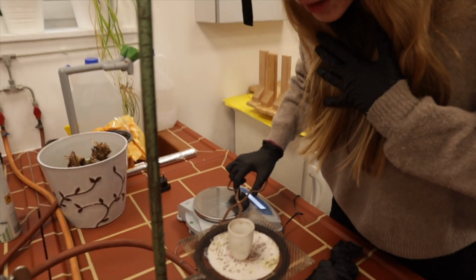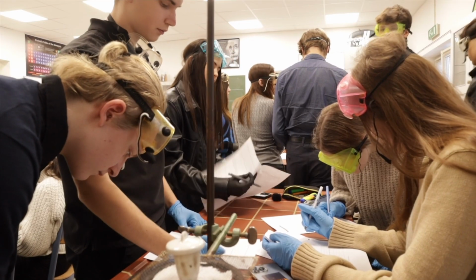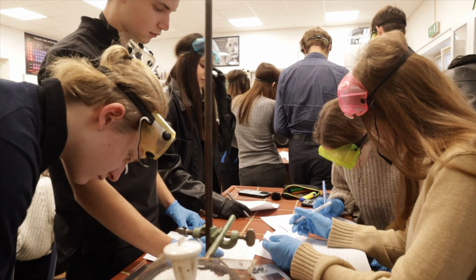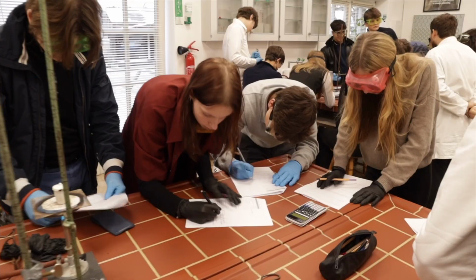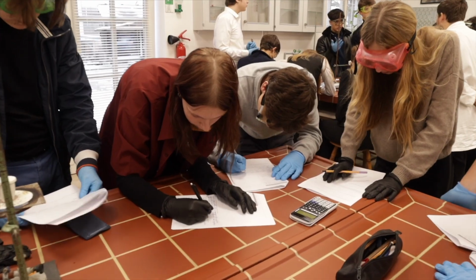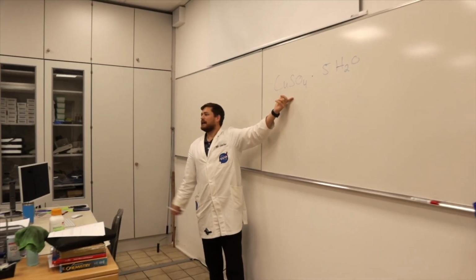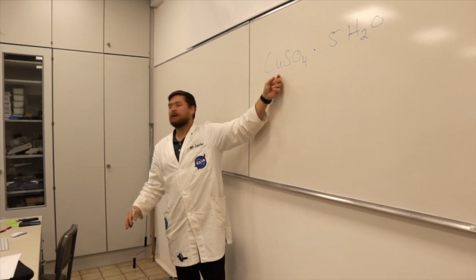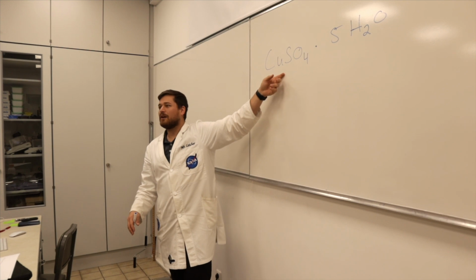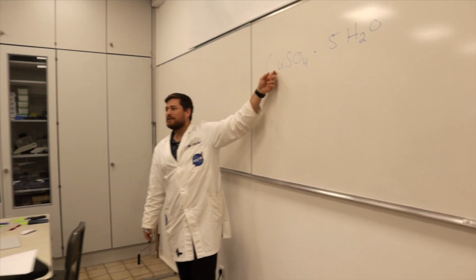Alrighty. It's a little bit blue. Oxidation. We're not affecting the copper sulfate, right? We discussed yesterday that our water is going to boil, right, at 100 Celsius, but our copper sulfate, I think Laura looked it up yesterday, it was like 3,000 is the boiling point for copper.